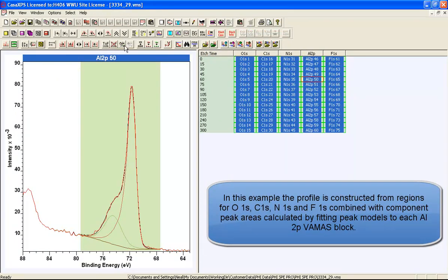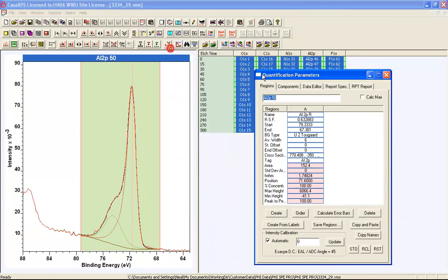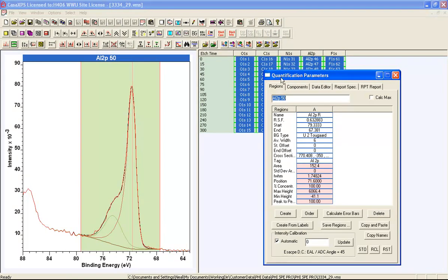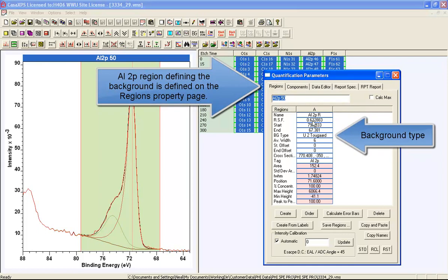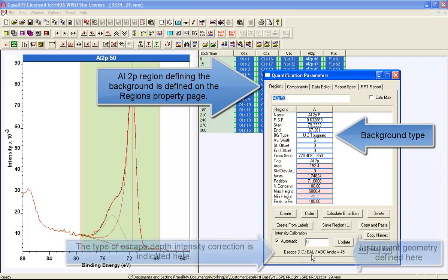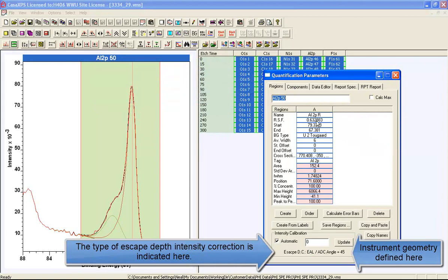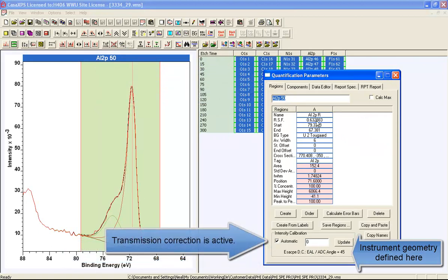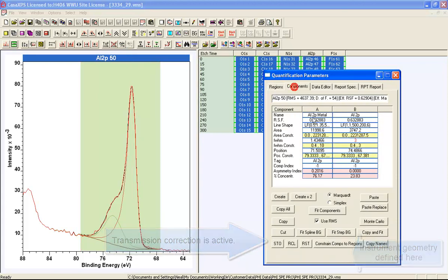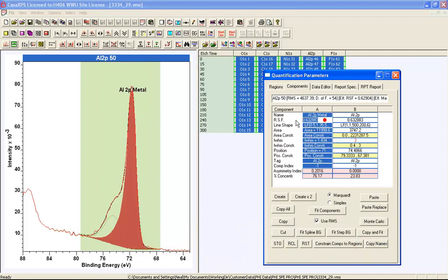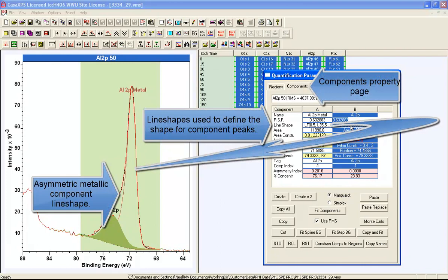To construct a depth profile, these regions need to be set up with appropriate relative sensitivity factors, a background, and also an escape depth correction for the corresponding RSFs. This is a Schofield cross-section corrected for an angular distribution correction relative to an S orbital where the angle between the X-ray source and the analyzer is 45 degrees. These data were measured from a Quantum 2000. The component pairs also have the appropriate RSF for the combined part of a doublet for an aluminium 2P.